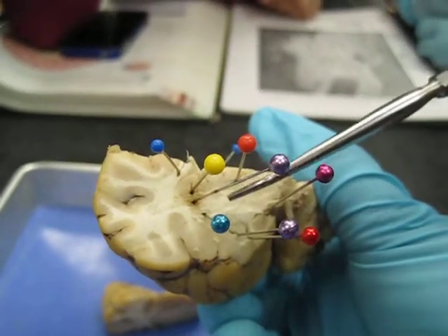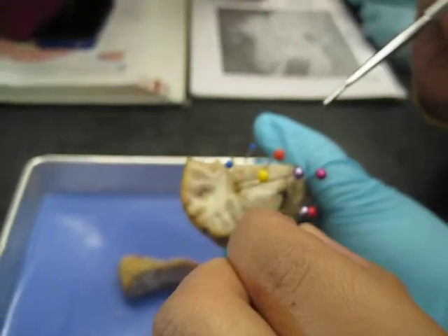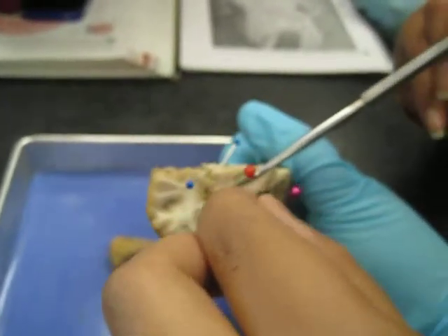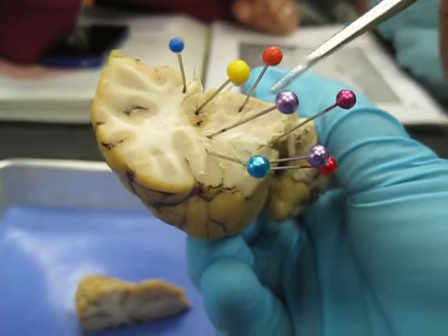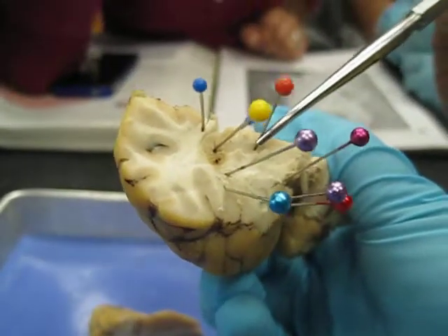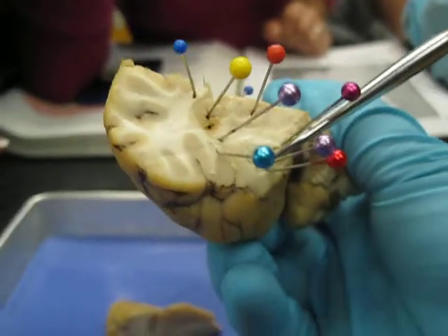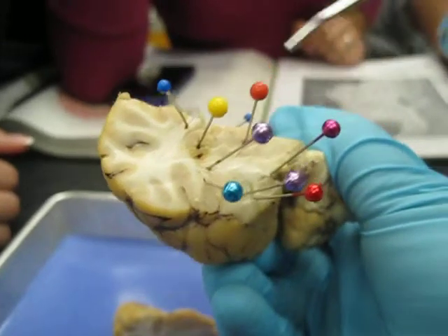This purple one, you should probably move it right here. Wait, so this goes here? That's fine, yeah. And then move the purple right here to the white stuff. So the purple is now the capsule. What's this red pin? Thalamus. And then what's next to the lateral ventricle? The amygdaloid body.